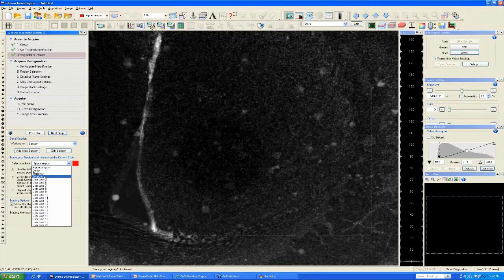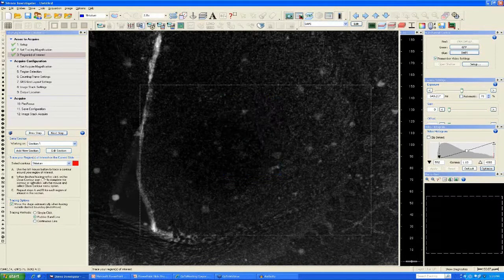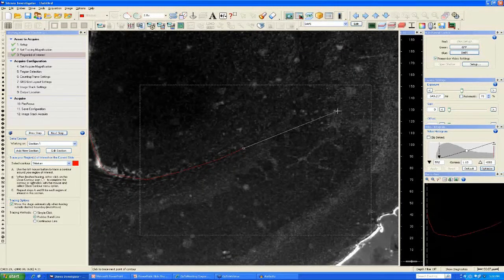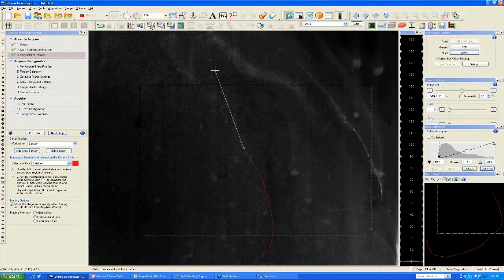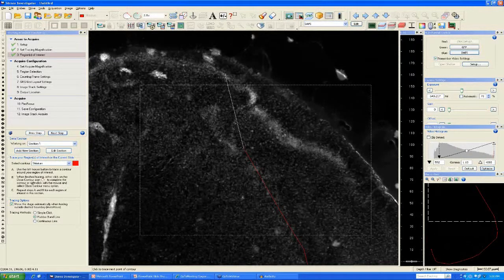I will pick the appropriately named contour, and if I choose to, I can even change the color. I'll now begin my tracing. As you can see, clicking outside of the auto move box moves the stage and my contour drawings together in such a way that the relationship between the contour and the anatomy being delineated remains together.